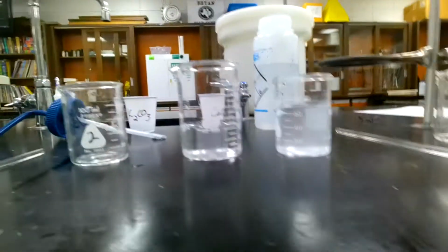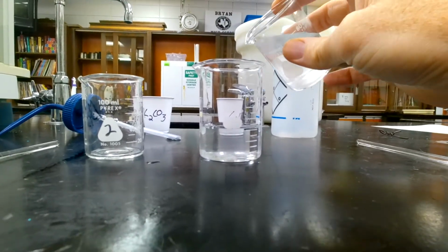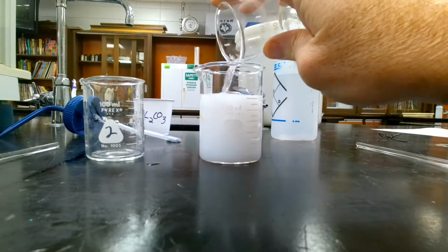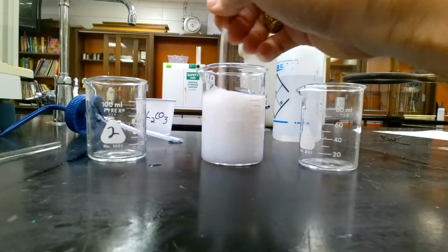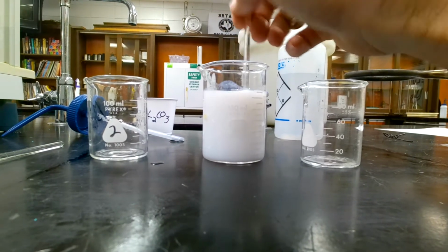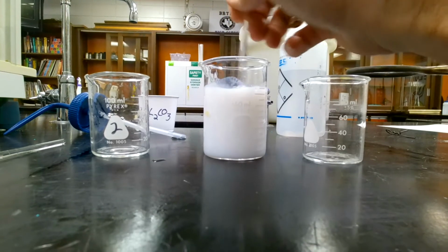That's not the best way you should pour, Mr. Russell. And then let's watch this one right here. As soon as we get it, it should make a precipitate right away. Very, very nice. So we're going to go ahead and stir this one up to make sure that the reaction goes to completion as far as possible. And then we're going to filter it.